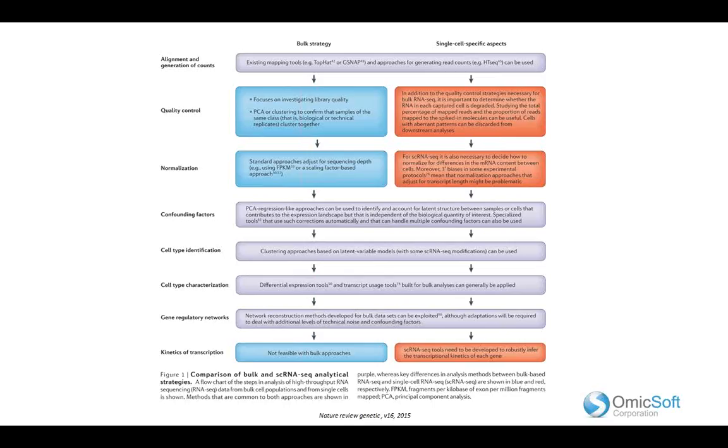So that's good enough. But the QC steps, and especially the normalization steps, are quite different. It's well known that single cell data has many zeros, right? Which is really affected by the signal distribution, but those single cell zero inflation require different specific models.